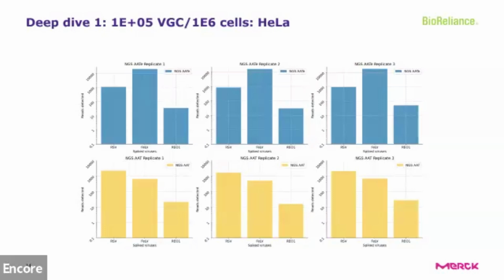You see the same in machine learning. I don't know if people saw my talk last summer. Of course, the K-mers that are specific to a certain taxon are weighted more than conserved sequences that are found throughout the viral kingdom. So yeah, you always find a little bit fewer reads, but that's fine for a qualitative assay. Then FELV, you saw that we detected more, and I'll get to why that is. And then Rio was more or less the same.